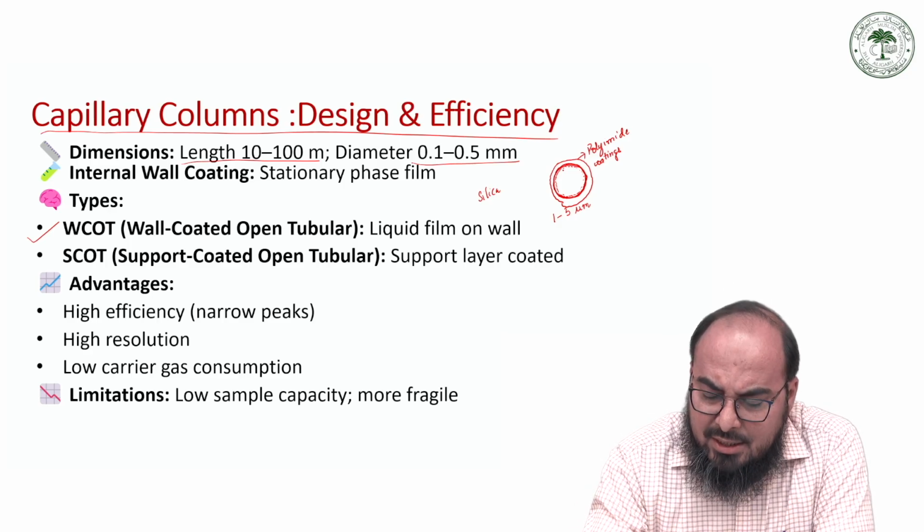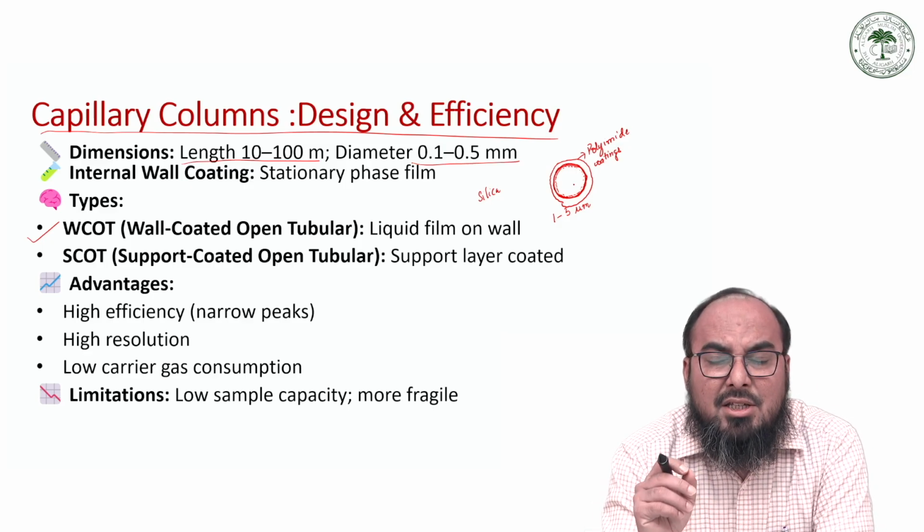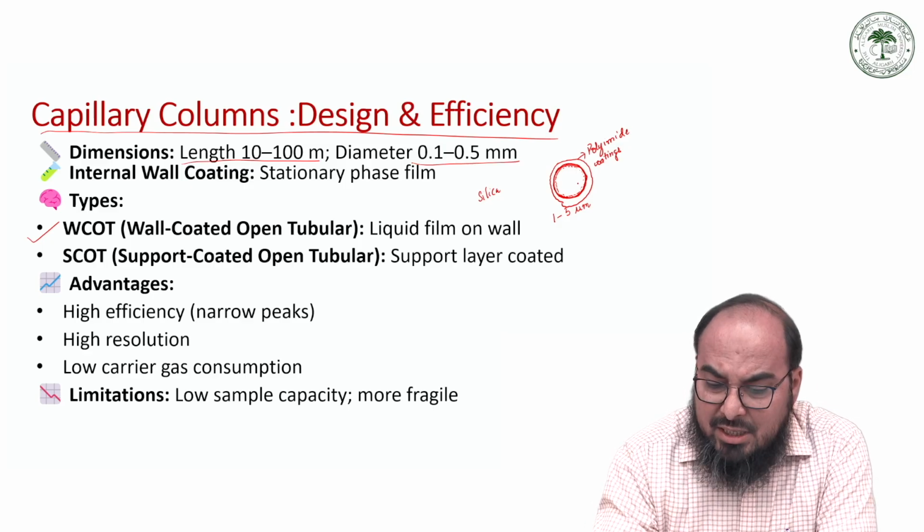So now you can see that this is your silica, and you have coated it with a thin stationary film that must be stable.